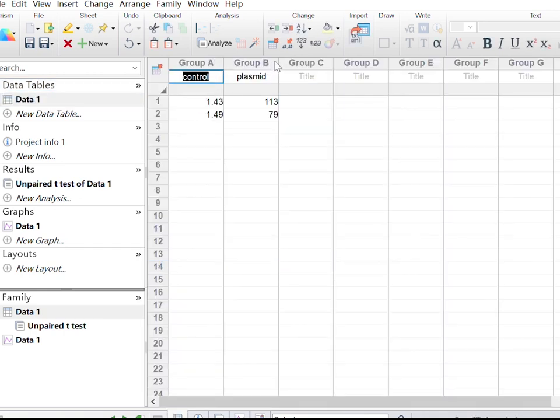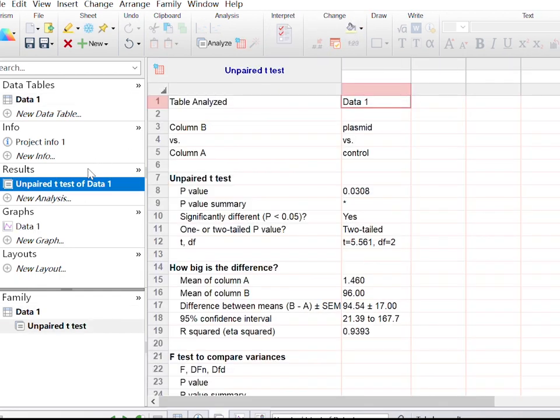Now we use a two-tailed t-test to see if it shows significant differences. Although it has a rather large 95% confidence interval, the p-value is less than 0.05 and we can mark it with an asterisk.